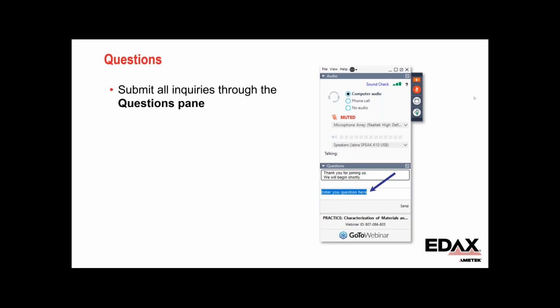It does an orientation averaging of the different triplets. So for both the higher and lower binning settings, they still have an inherent averaging, and I think both precisions are relatively similar, not a huge improvement from one to the other. But I think where the precision possibilities come in at any speed will be with the refinement. So, Will, maybe you could comment on that.